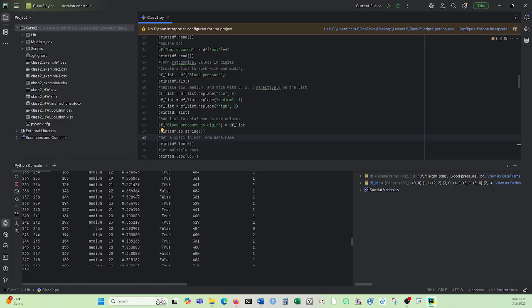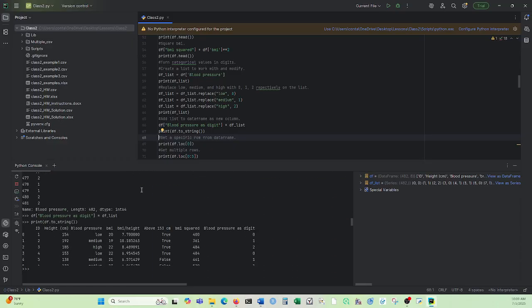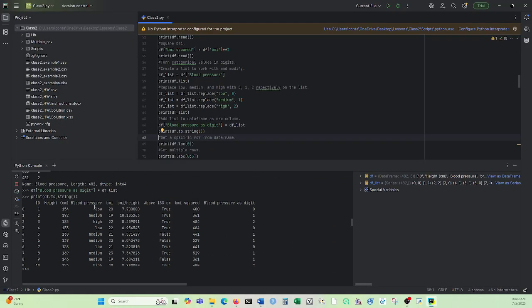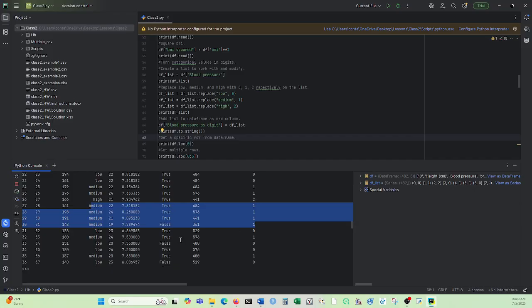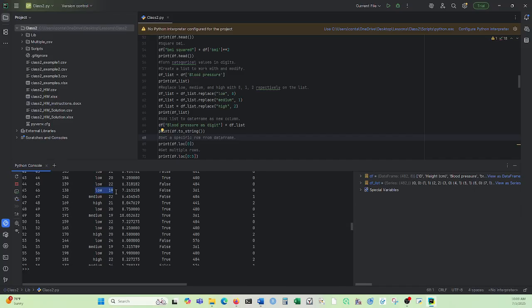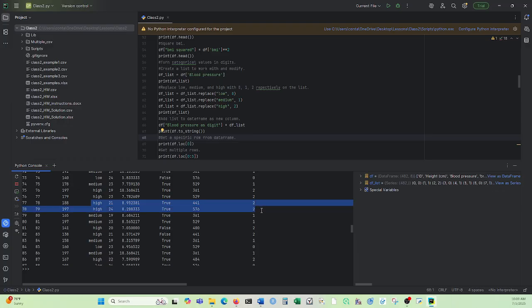And when you do this, just double check and make sure the values line up. You want to make sure that low actually has become 0, and so you can see high, and then you can go all the way across and see now, oh, it is 2. And just go through it and make sure that it has worked as intended. You don't want to have mismatching data. Yeah, it looks good.